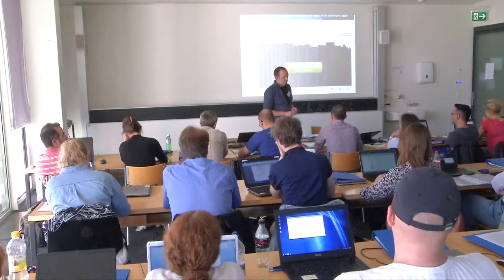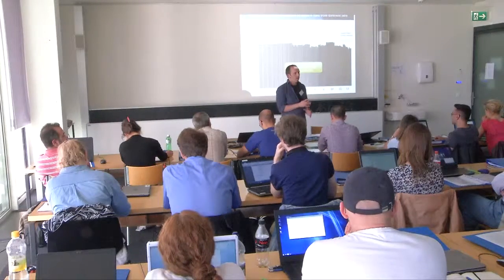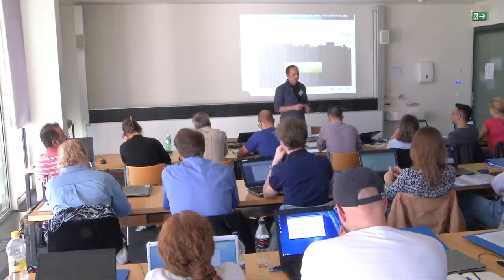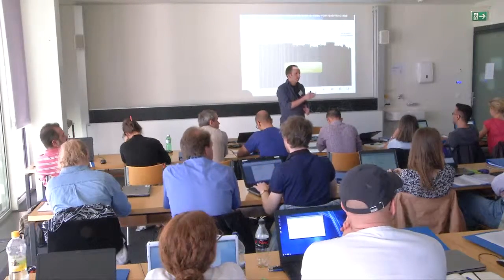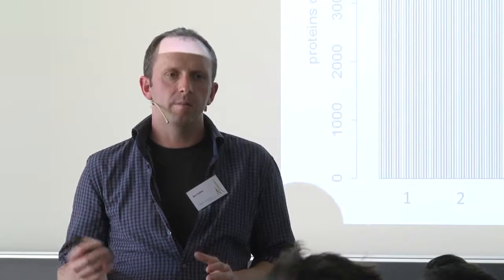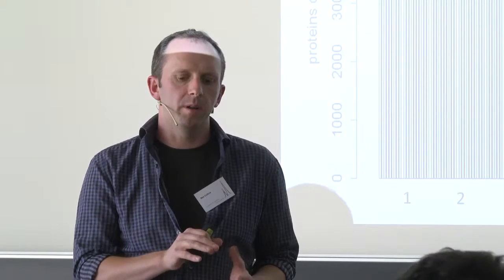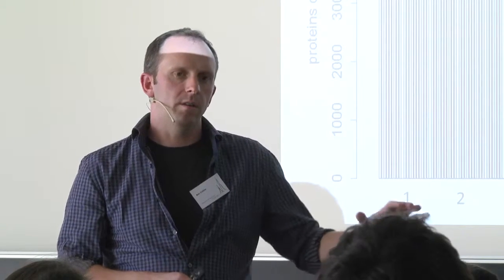I guess I can't speak specifically about histones. I can speak a bit more generically about post-translationally modified peptides. These are more challenging. Actually, Ariel is going to talk about phosphoproteomics, probably tomorrow. No, Friday. So he will go into a lot of detail on targeted phosphoproteomics. It is more tricky. There are certain things you have to be careful about, but in principle, if you have a library spectrum for the post-translationally modified sample, then you should be able to extract that signal in the SWATH analysis.